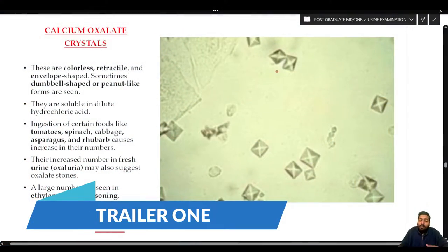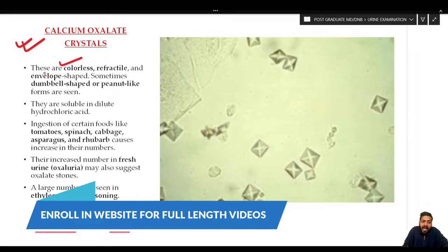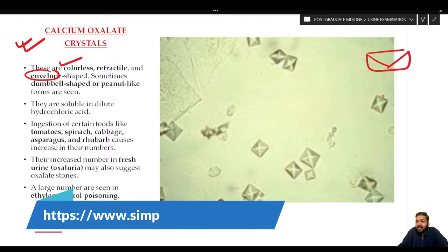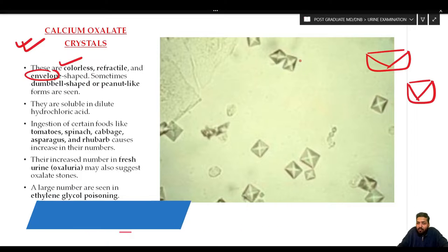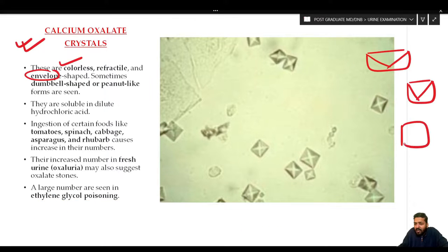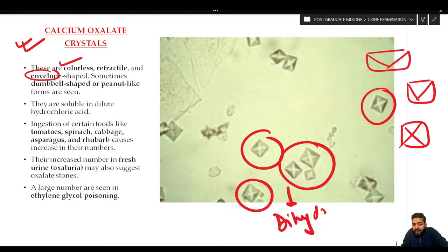The next type of crystal that you might have come across, very commonly seen in normal acidic urine, is the calcium oxalate crystal. As you can see, they are colorless, refractile, and envelope-shaped — basically a squarish envelope. These are the calcium oxalate dihydrate forms, which are envelope-shaped.